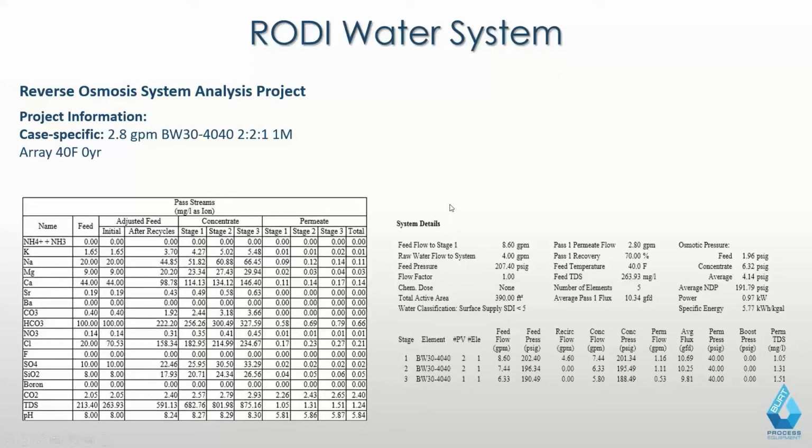So this is kind of what goes on behind the scenes when you're talking about the water quality required. Because when you come out of here, you're basically looking at water which is, at this point, around half a megohm. And then from there, you do your additional treatment to where you want to go, ASTM, CAP, etc.